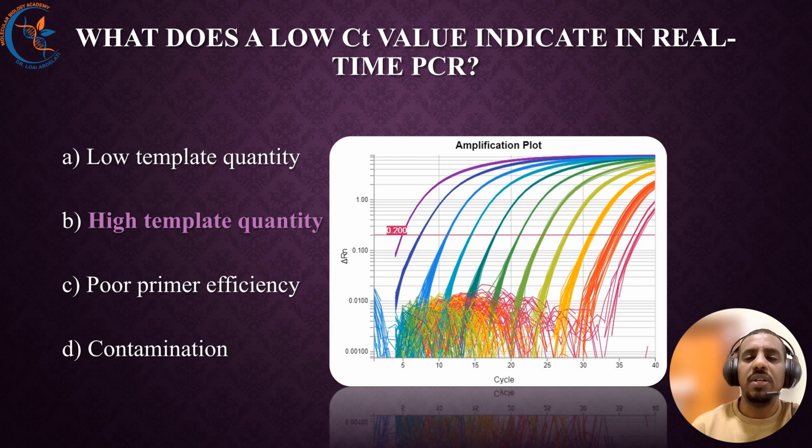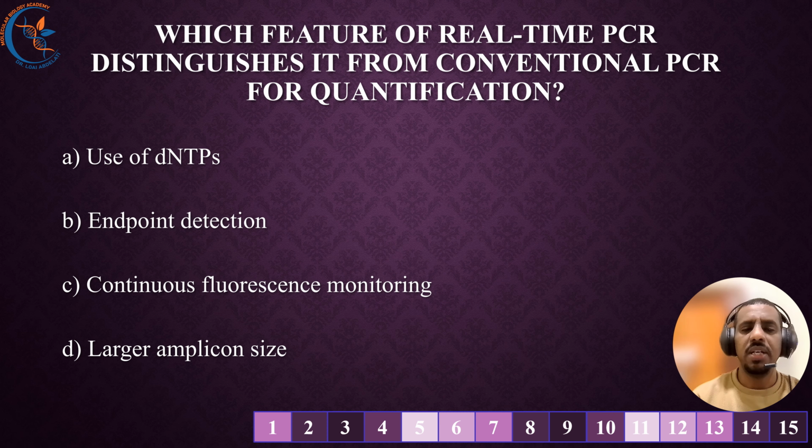Okay, let's move on. All right, the next question here: which feature of real-time PCR distinguishes it from conventional PCR for quantification?